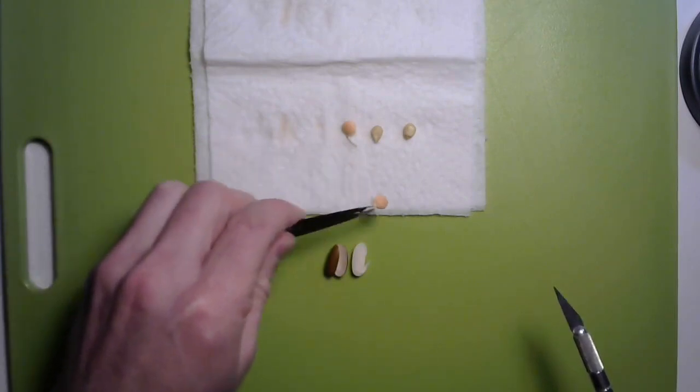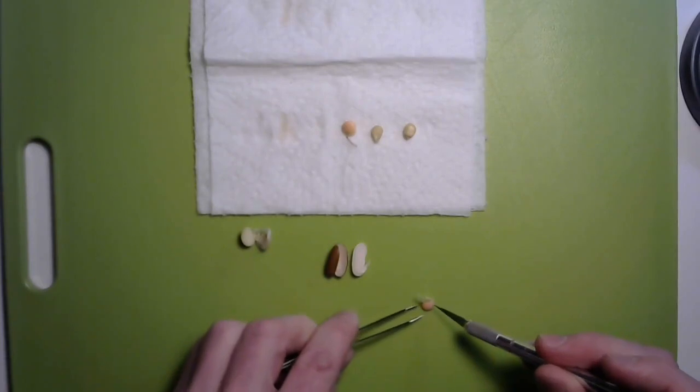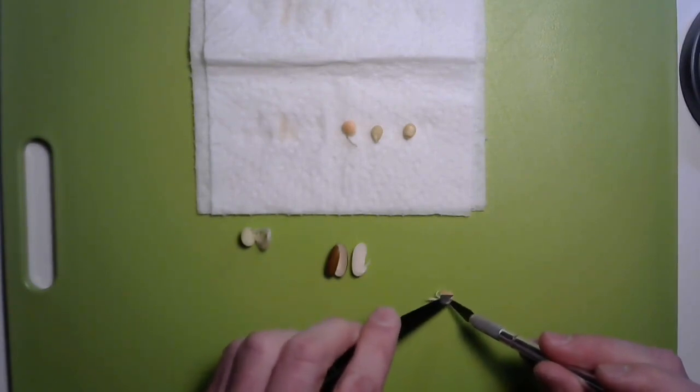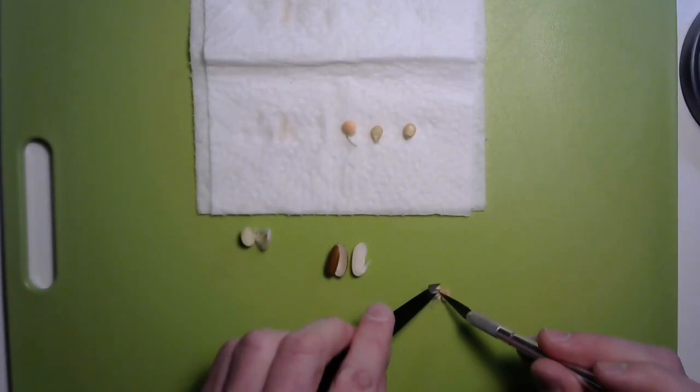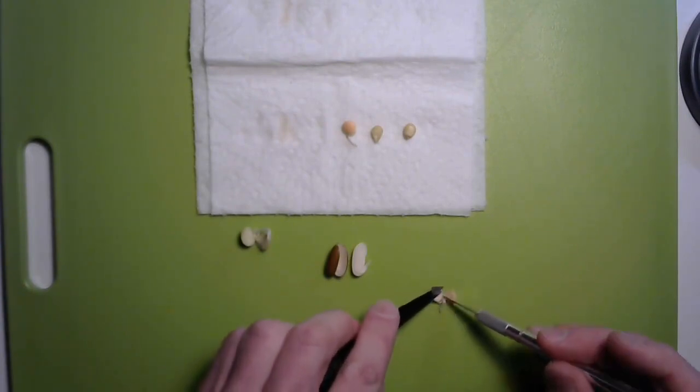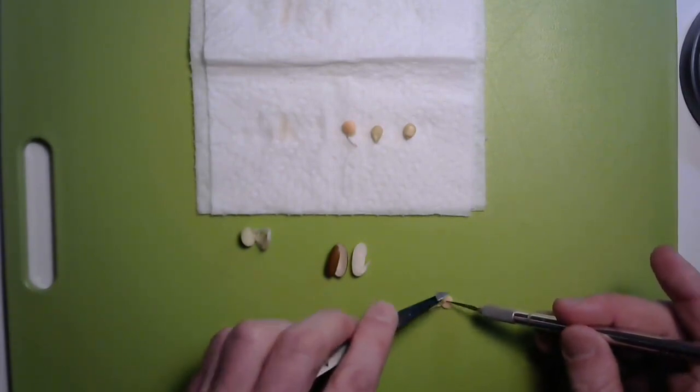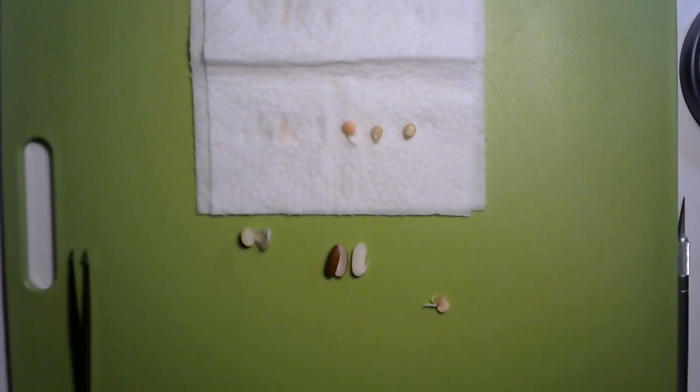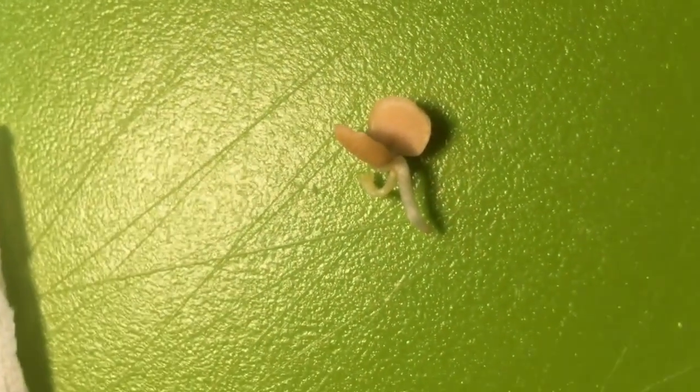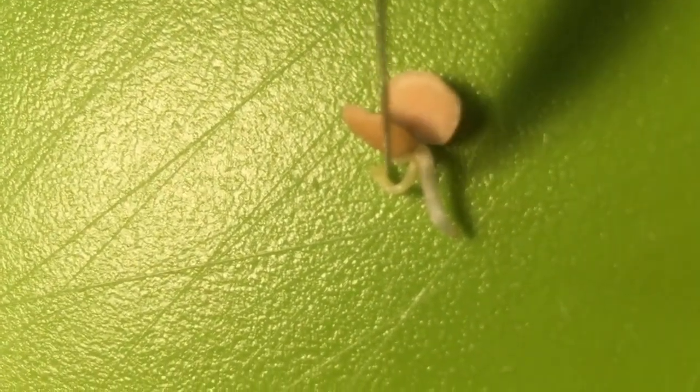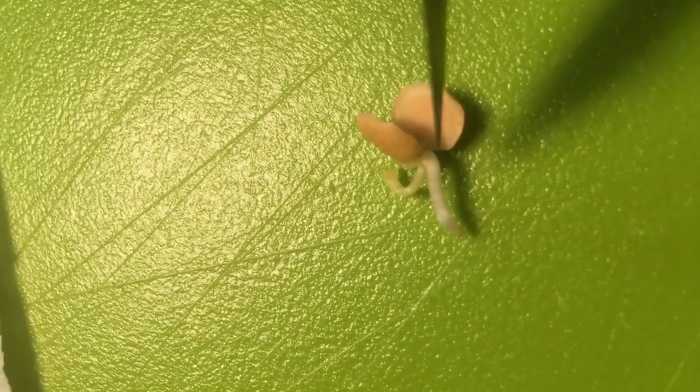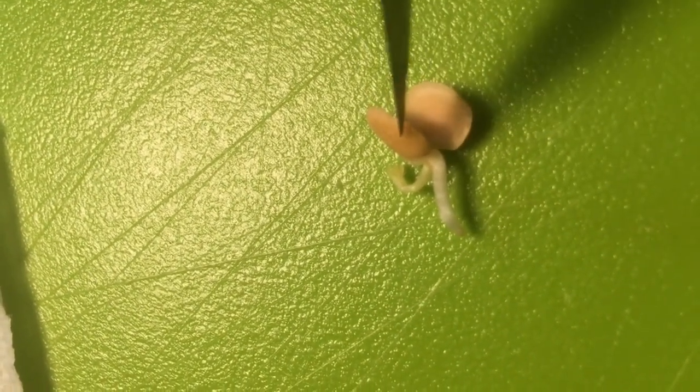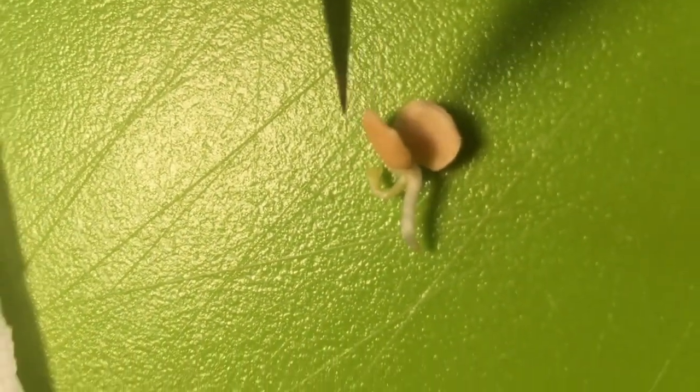Again very carefully, I'm going to take it with my tweezers. This one is actually a split pea or a type of red lentil, and it doesn't really need to be cut—I can just wedge my knife in and pop it open. There we go. Fantastic. In this one you can see the baby plant very well because it has a little bit of green in it. Right there is the plumule, nice and green, and the radical, nice and white, and then each of these we call a cotyledon, sort of a cup of food that the plant's going to use to get itself ready. And notice this one broke into two pieces very easily.